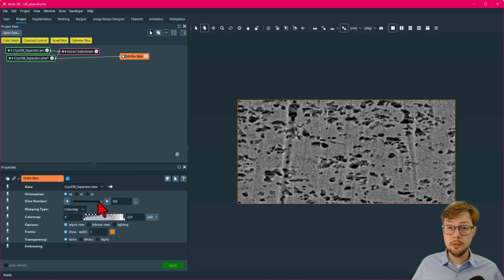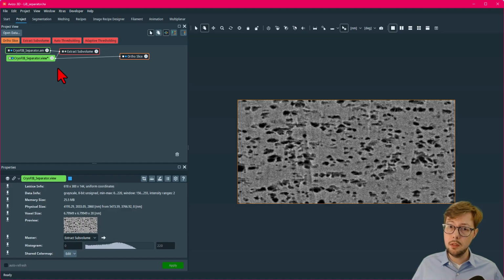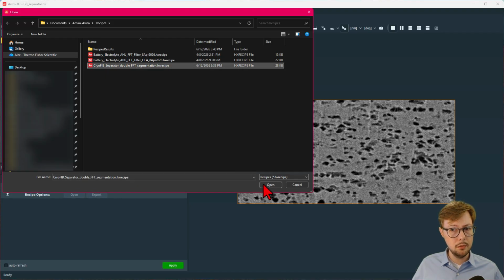You can use recipes in the project workroom. Open the module browser without selecting a dataset or display. You'll find an option for Recipe Player. This recipe player behaves like a compute module.